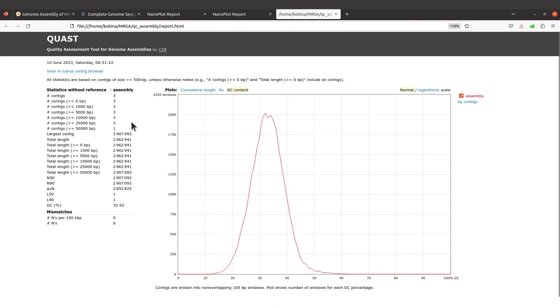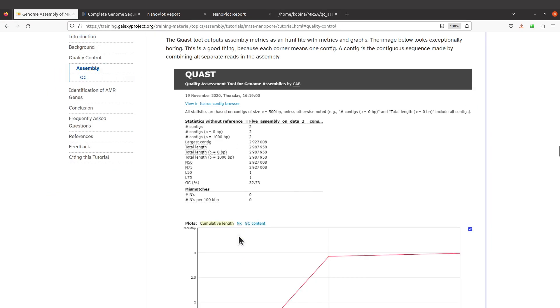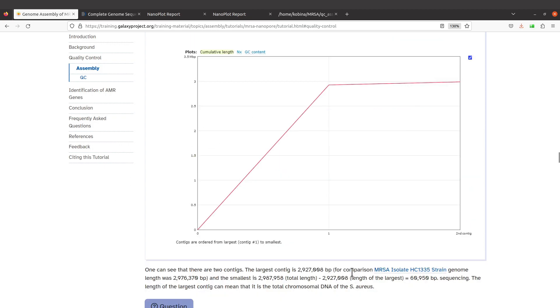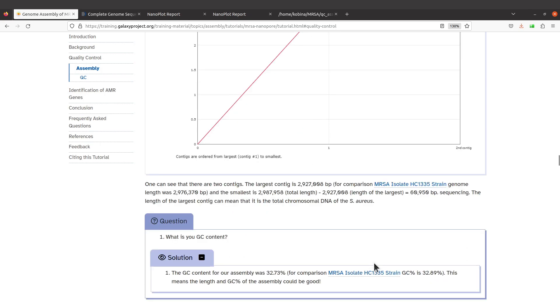So the conclusion is the same as what is given here, because we also have something similar. You can try to improve it or you can use that for downstream analysis. Since it's not exactly the same, there are a number of factors which I've made mention of, and there could be others. So the most important thing is to make sure you have something very close.